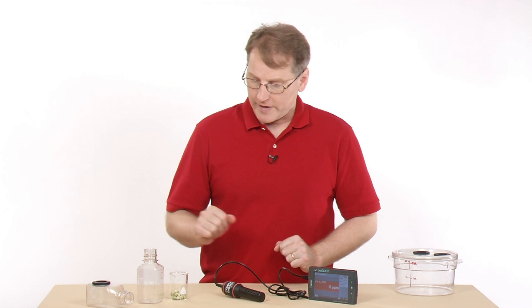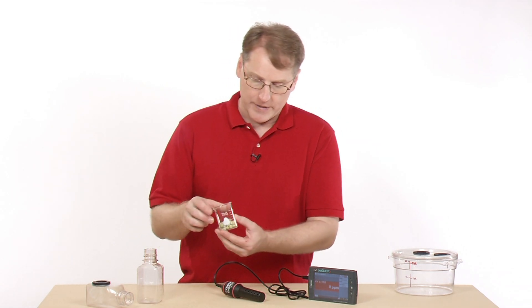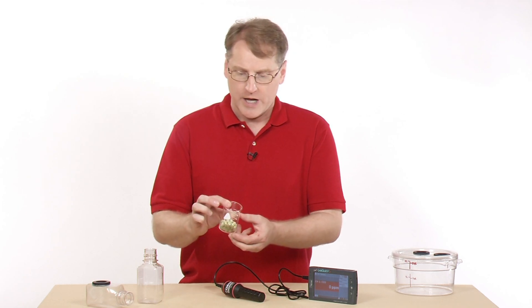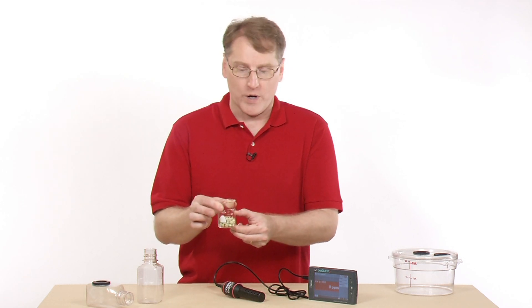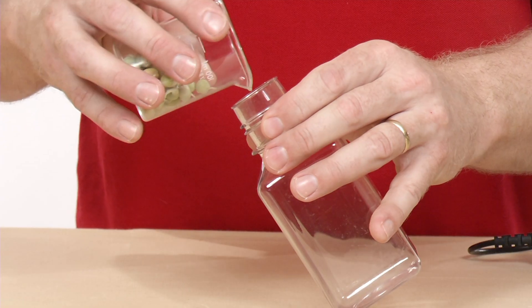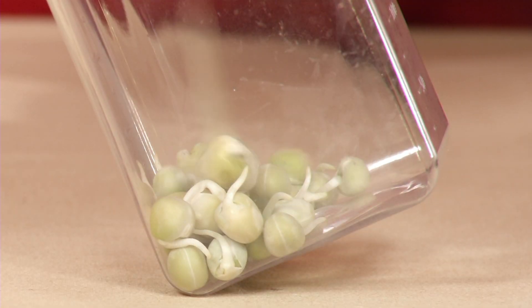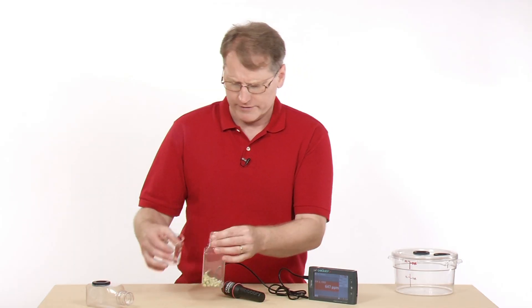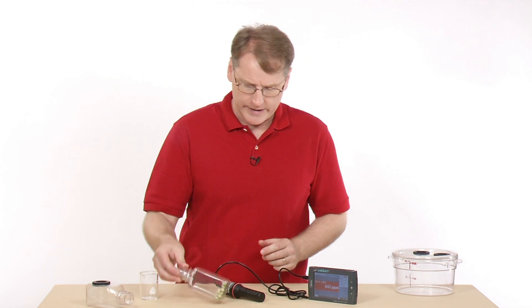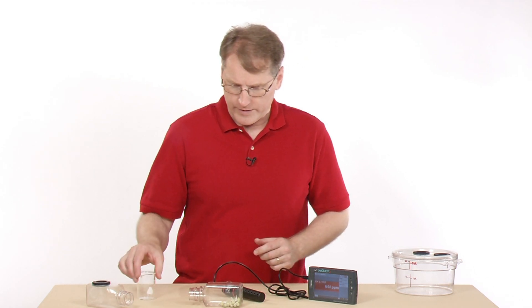While it's warming up, I'm going to take my peas — these are peas I started soaking a couple of days ago, so they're actually sprouting and probably producing a lot of CO2. I'm going to place them into my bottle. There are about 25 or so peas.